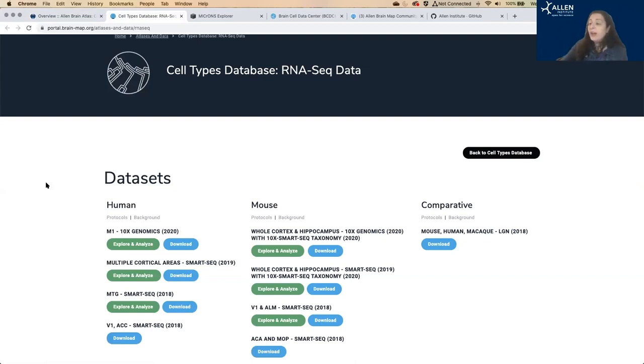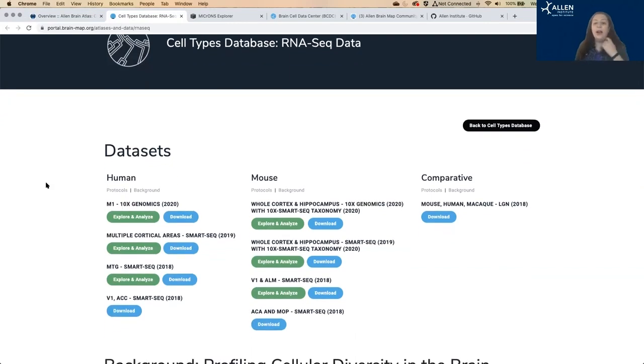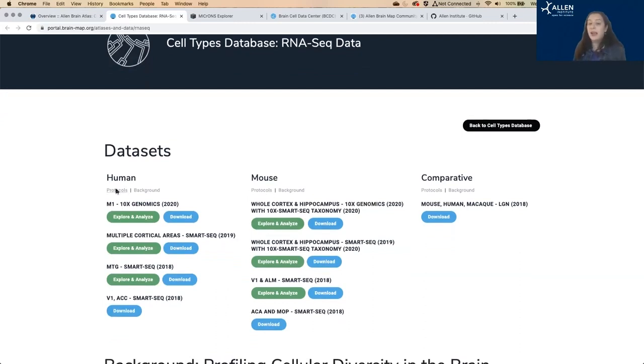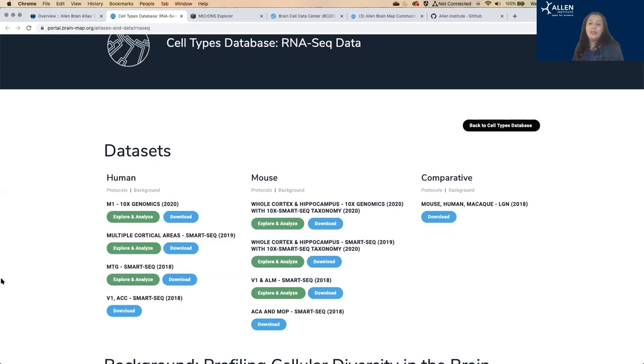So we have multiple data sets from mouse whole brain, whole cortex, and from human from selected brain regions, mostly from post-mortem donations. We have single cell RNA sequencing for mouse and single nucleus RNA sequencing for the human of the whole genome for both species.